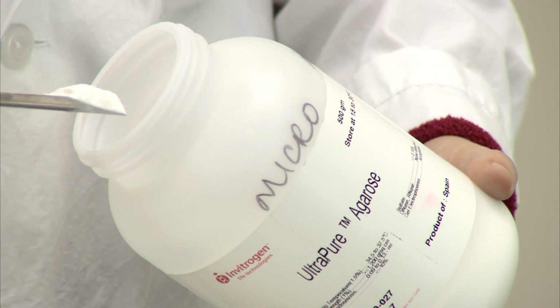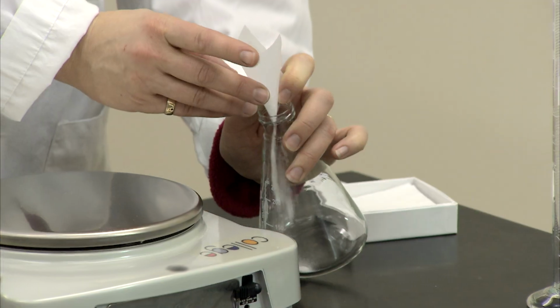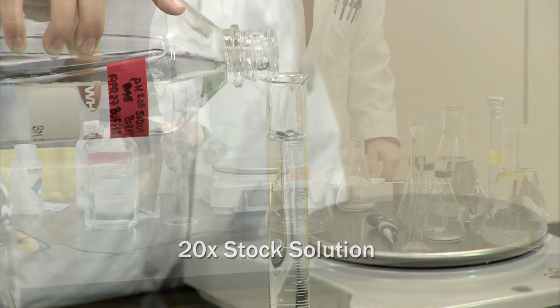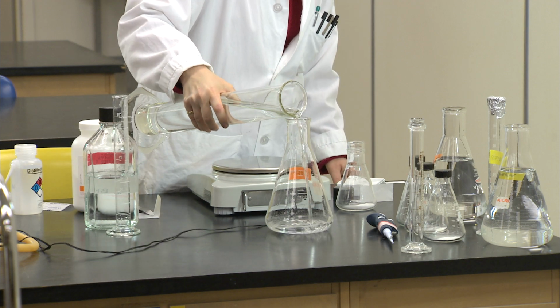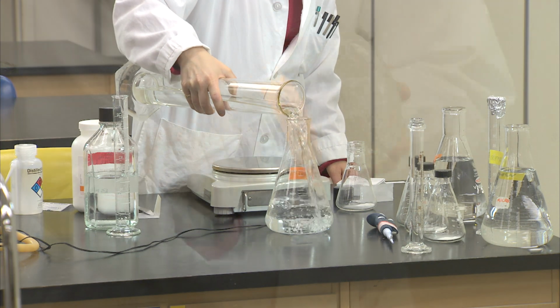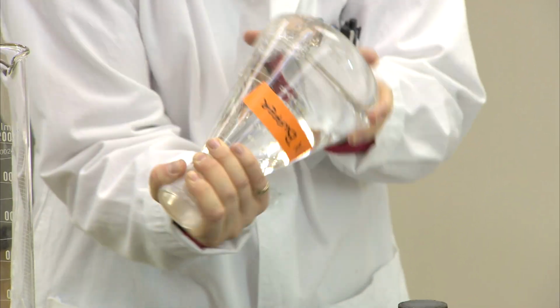To start the process, an agarose gel must be made by weighing out the powdered agarose and appropriate volume of buffer. It is common for the buffer to be made as a concentrated stock solution that will be diluted as needed, as shown here. This buffer will be used to make up the gel and surround the gel later on to allow the electrical current to move the sample through the gel.